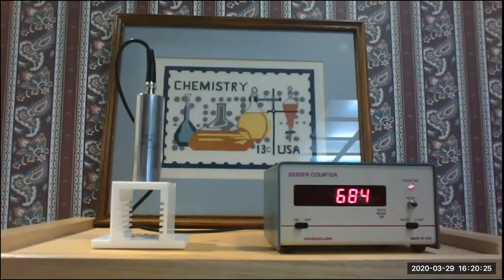There's definitely some uncertainty in these numbers because radiation is a sort of sporadic event, so that some of these, if you repeated this experiment, some of these numbers would be lower, others would be higher. So we need to have multiple values in order to get a reliable trend line for our analysis. Five, 20, at six.